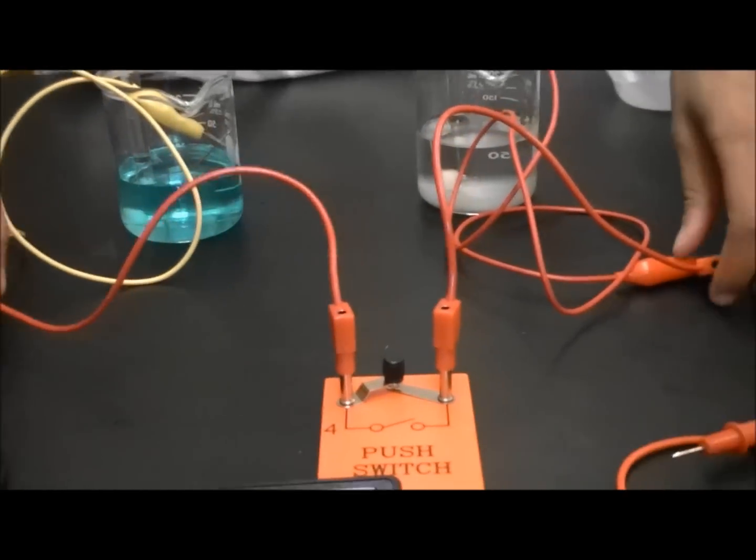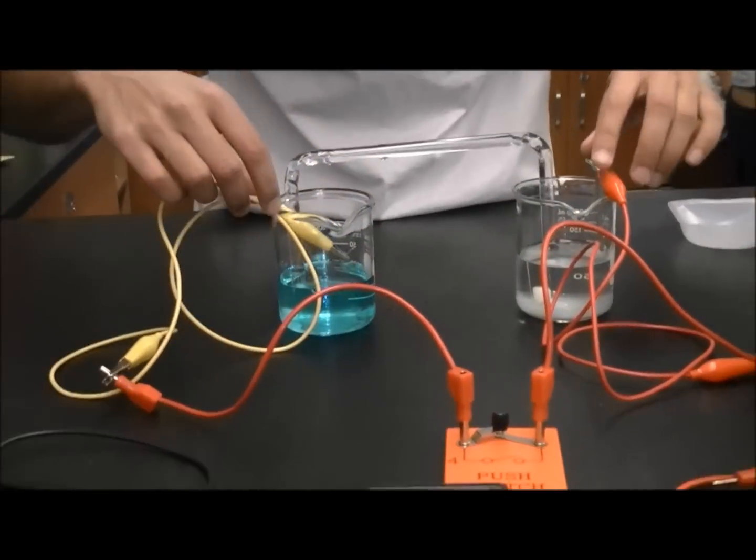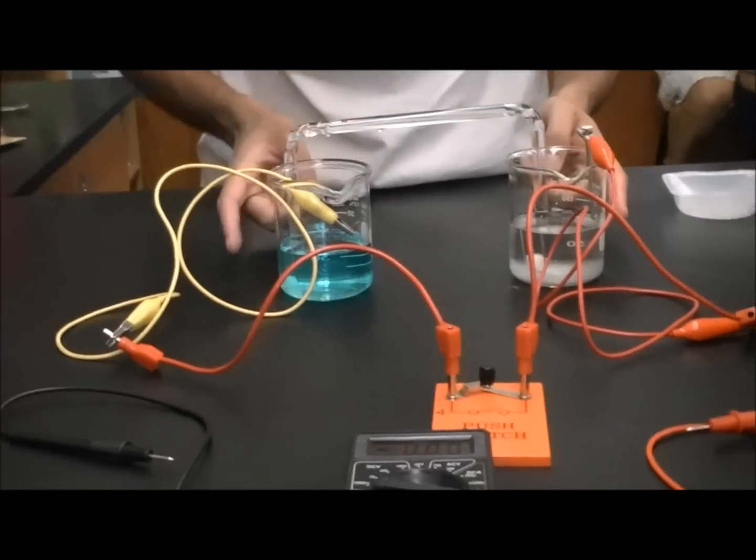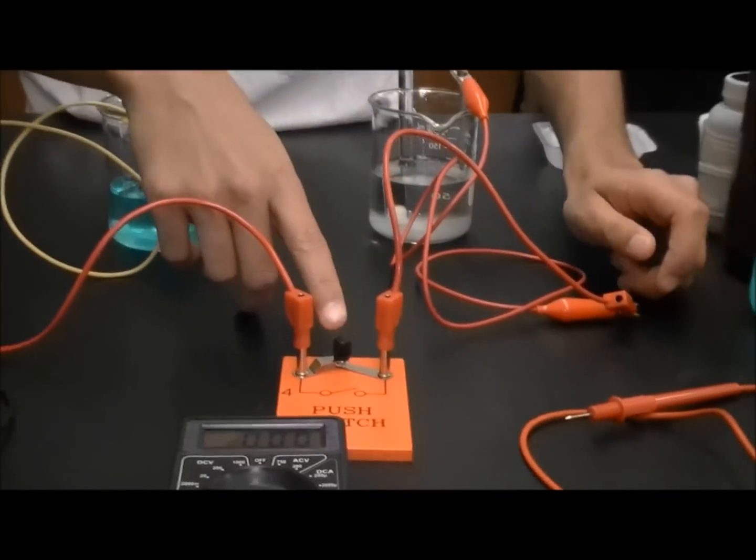Ok, so here we have our galvanic cell set up. Our salt bridge is here. Our electrodes are here and here. This is the anode, this is the cathode. Now, we have alligator clips attached to this, attached to the push switch right here.